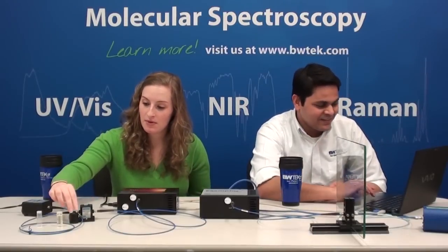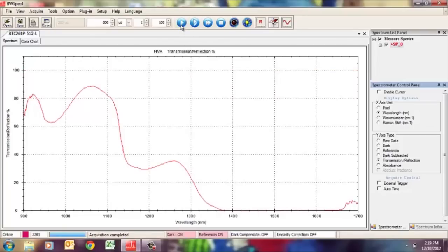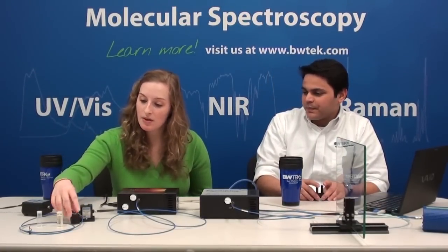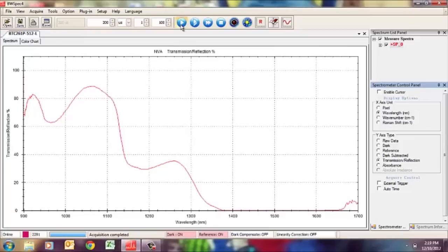Which do you think will be more transmissive — water or oil? I would assume water because you can see through it, it's clear. Let's find out. With water in the cuvette, it's almost opaque for the most part in the NIR spectrum. Now with oil, taking a single acquisition, oil is actually much more transmissive than water in the NIR. You were correct that water is more transmissive in the visible region, but as we saw in the NIR, oil actually becomes more transmissive than water.